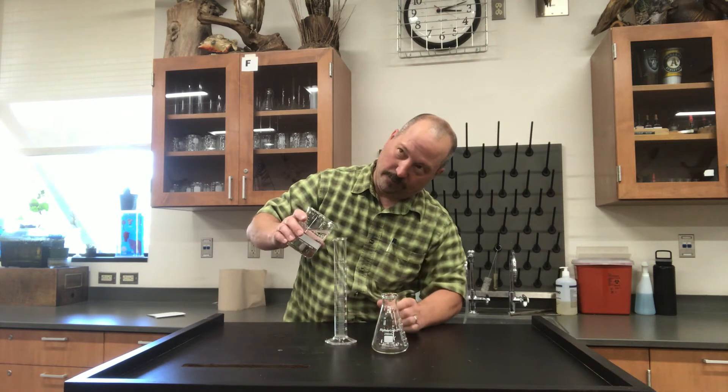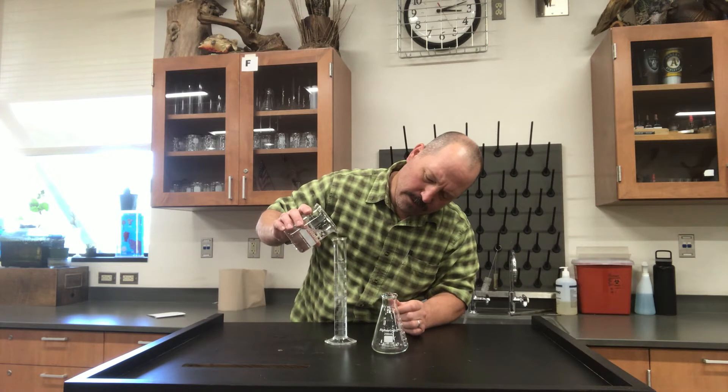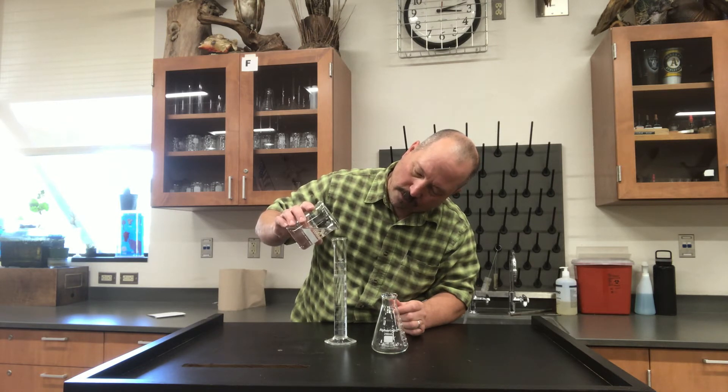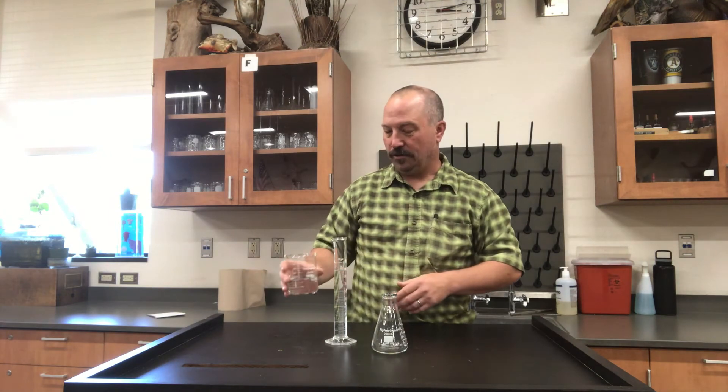Holding this flat, say I want 90 mils — the beaker allows me to very delicately transfer that liquid precisely, rather than if I just held this under the sink. It wouldn't be flat and it would also come out too fast and you couldn't control it.